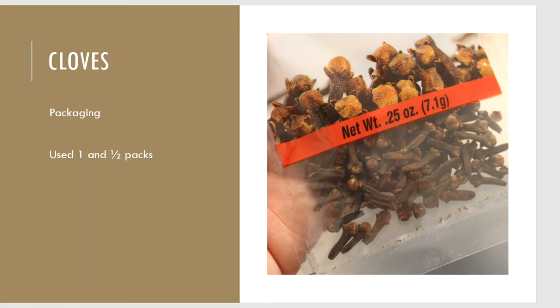If I zoom in you can see the cloves — the bud up at the top and the stem part down below. I did use about one and a half packs. Before we weigh it out, we've got to crush them. We have to increase the surface area so we can extract the clove oil a little bit faster, helping this process go quicker than what the steam would do on its own.